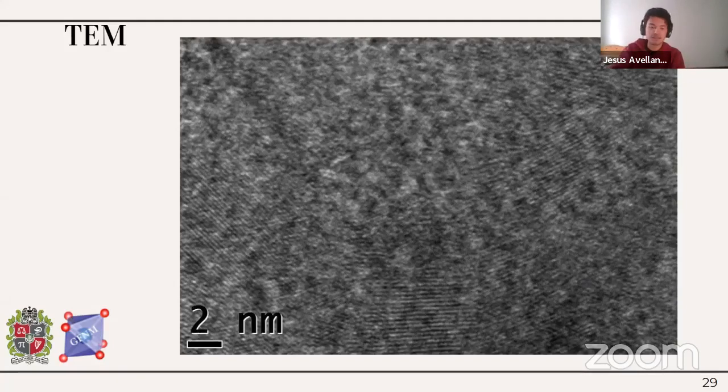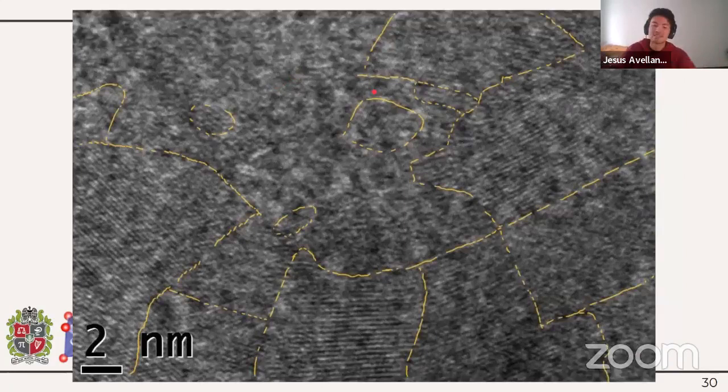In this case, the TEM used is one of the Lorentz type. That is, we have a beam of electrons passing through the magnetized sample along an axis, and we are measuring the Lorentz force reflected along the x-axis when the passing beam of electrons interacts with the material. So as you can see right here, the goal of analyzing this data is to use software such as ImageJ or Python to establish structures, such as making a schematic representation of walls of ferromagnetic domains or magnetic domains, and establish the main characteristics of the magnetic response of our material.